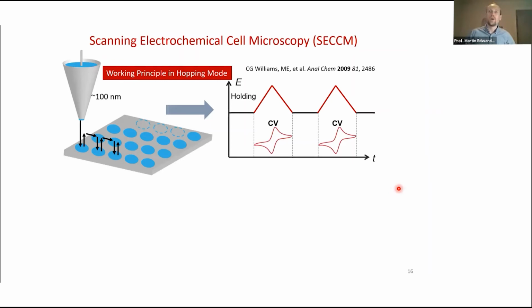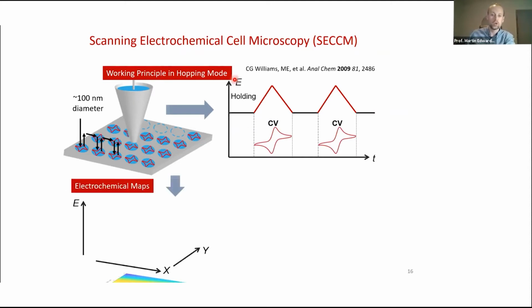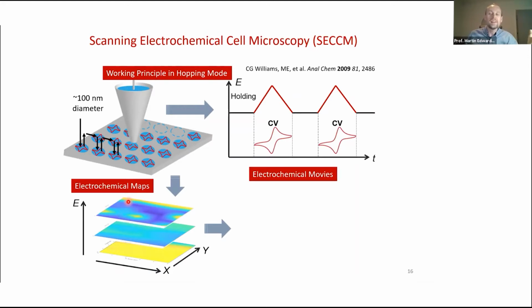We're in a scan probe conference, so it's perhaps no surprise to you, we don't just do one measurement of 100 nanometer area, but we do a bunch of measurements. And our operating procedure, we call it hopping mode, but it's pretty similar to doing, say, force distance curves at every point. We touch the tip to the sample, pick it up, and we're doing a point-by-point measurement. We're still controlling the sample. The data set we get, at each XY position, we're going to have the current versus the potential. And so, again, you AFM people, think of an analogy to a force volume kind of measurement. We've just got an extra dimension.